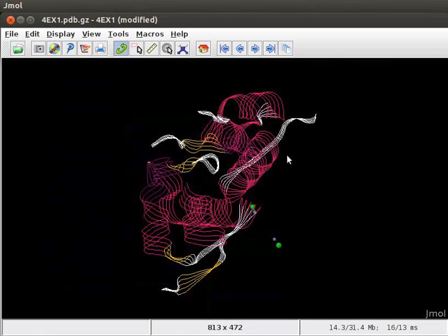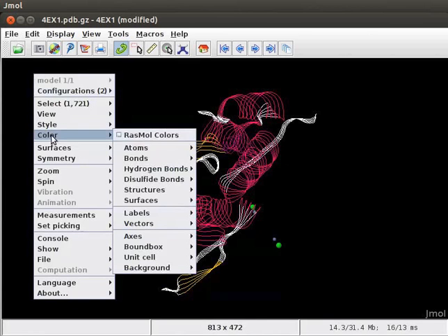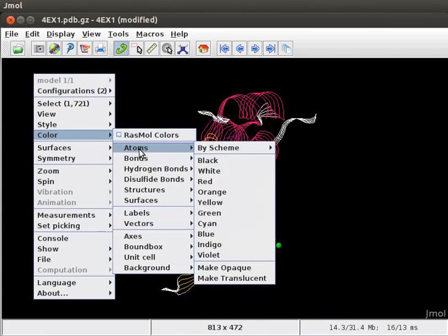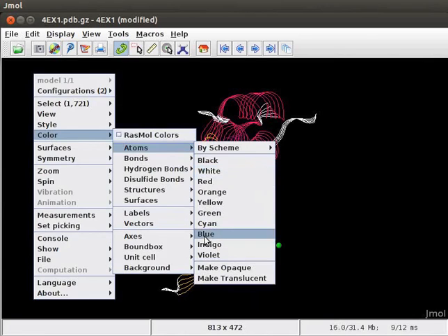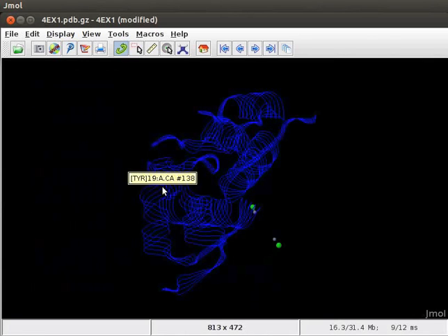To change the color of display, open the pop-up menu, scroll down to Color, select Atoms, and click on Blue option. Observe the change in the color on the panel.